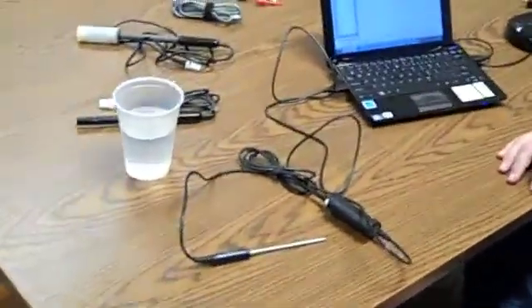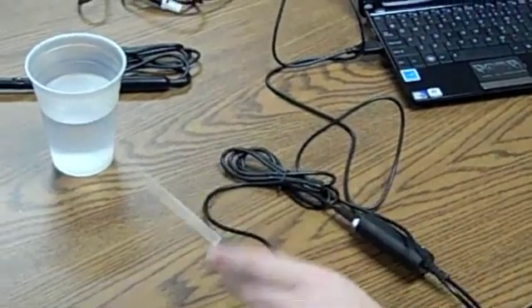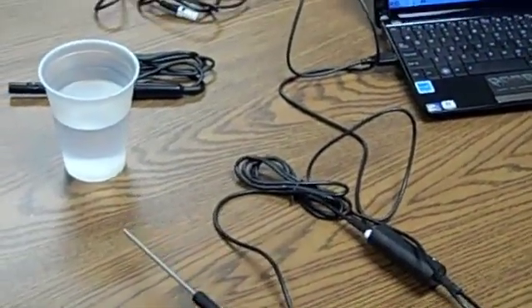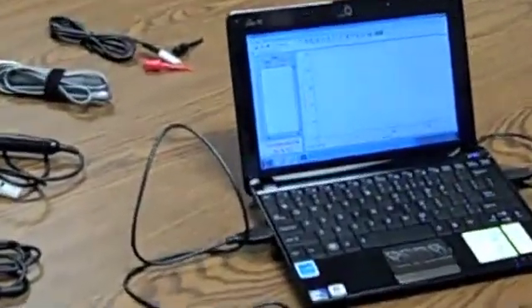Does that look like a thermometer right there? So this is a temperature probe and allows you to take readings of temperature and it will graphically display on the screen as well as speak through JAWS. Great, let's see how it works.